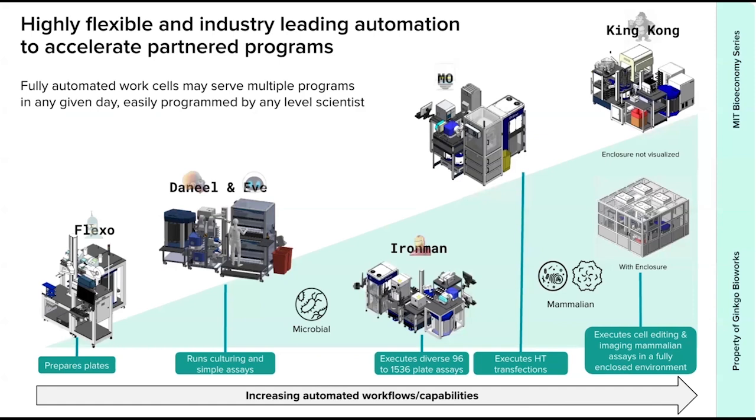And so with these integrations over time, we've been able to write software at the very boring level that lets new drivers come about so that disparate third-party software and hardware can talk to each other. Very boring, but important. That you can upload data and process it and have good quality control metrics, because when you get to that scale of handling 10,000 samples in a batch, you need cameras, you need different logic for liquid level, you need different logic for transfer success validation, because you just can't get your head around that.